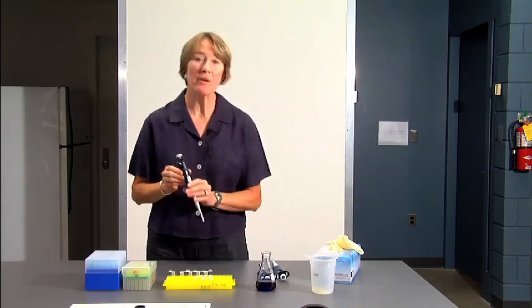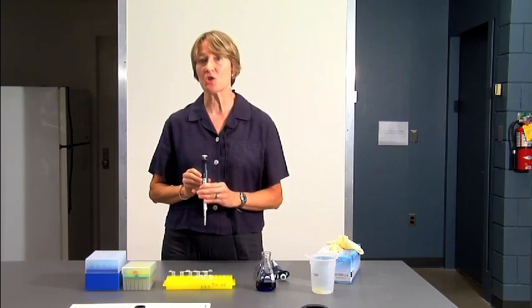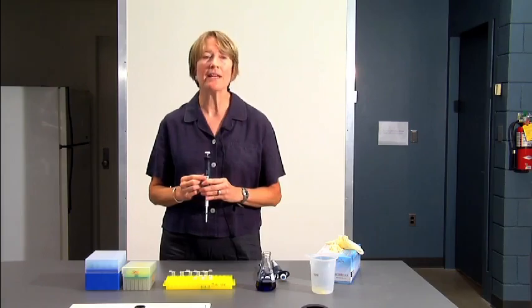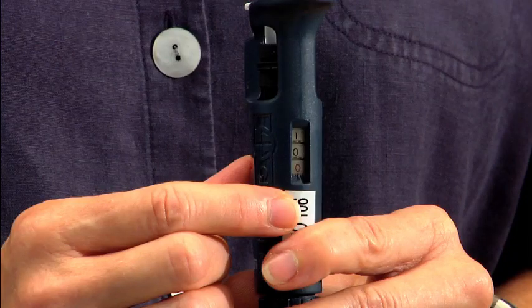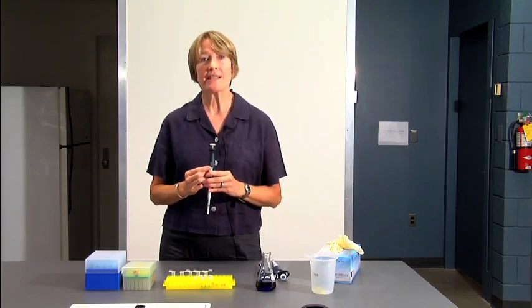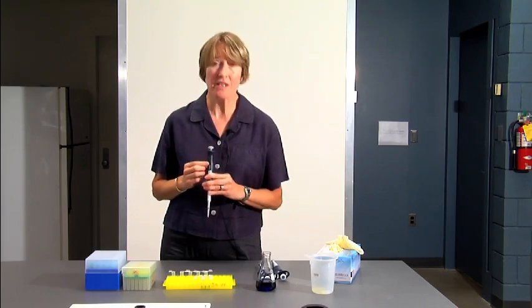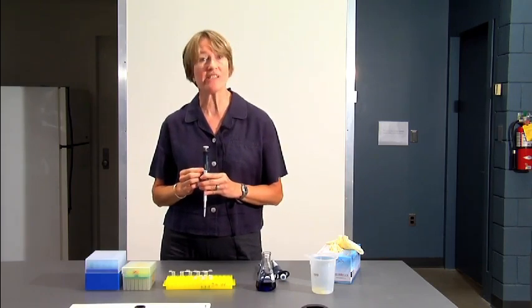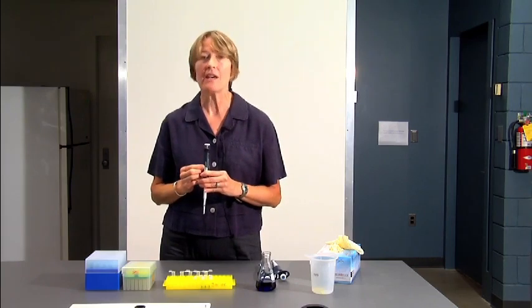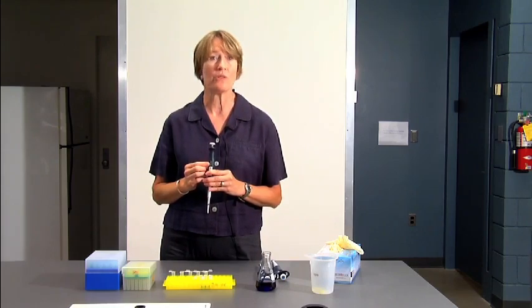The third pipette that we'll be using is the P20, which measures accurately 2 microliters to 20 microliters. This also has 3 numbers on the barrel, but notice that the bottom number is in red. That is an alert that tells you that bottom number is tenths, so there's a decimal point before that number. So if the dial reads 100, that stands for 10.0 or 10 microliters. If you wanted to measure 2 microliters, you'd set the dial on 020.